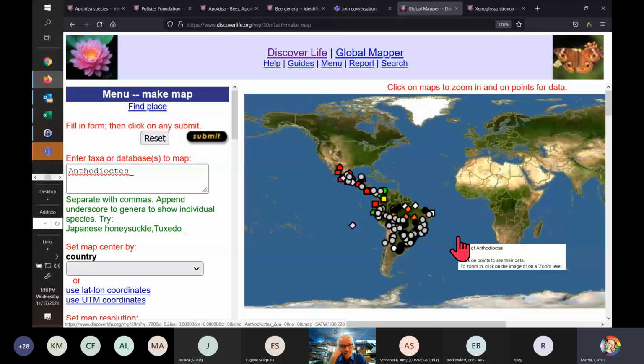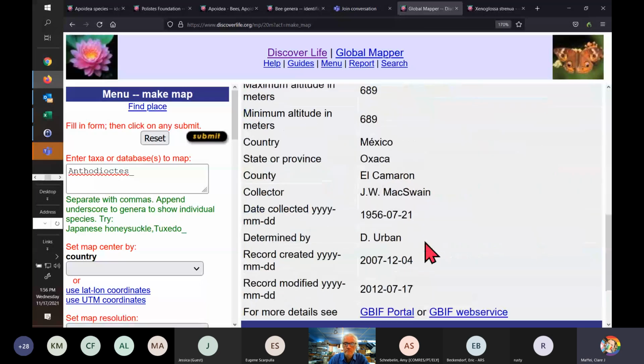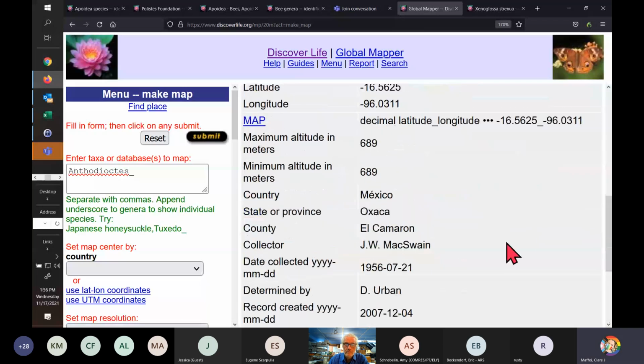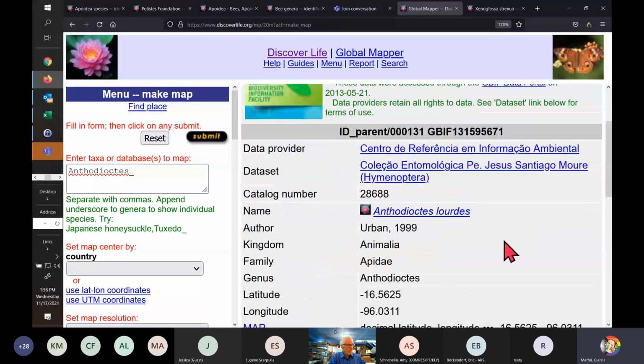Let me pull this up. I had another email question. Can we remind the group what microscope we're using for the sessions? Perhaps not as good as a regular dissecting scope, but since it's digital, wondered if it's the portable kind. Are we talking about the one I'm using right now? Yeah, the one that we're using from Craig.